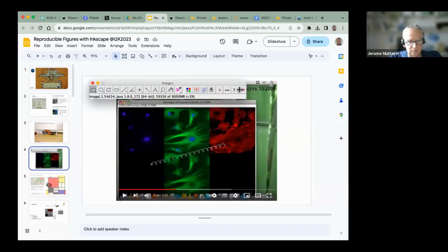When you go to the additional tools, it's called Magic Montage, and from an image stack you can easily create a simple montage. This is fun to use, but not so convenient because every panel should be exactly the same size. Still, it's playful because you can rearrange them very easily. Then you have a few shortcuts to make channel overlays and crops, some very specific but efficient tools. But someone told me that it's basically a toy.